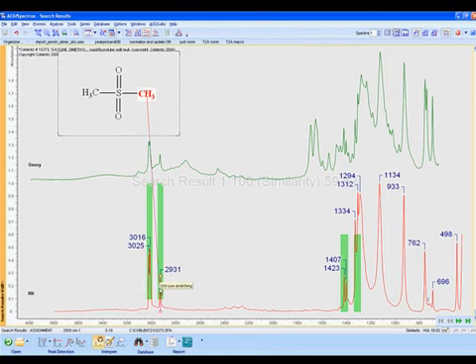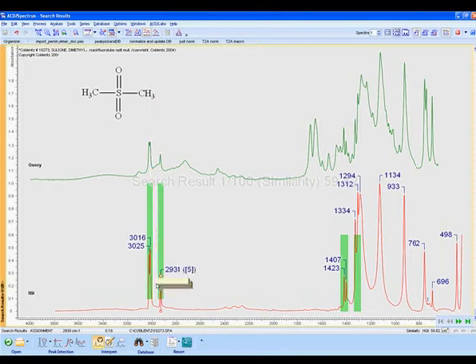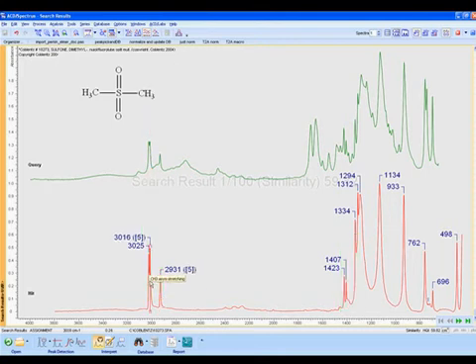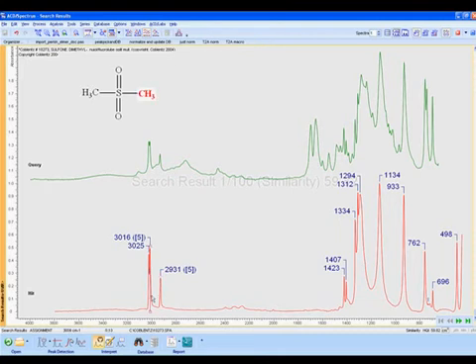To make a correlation, we can simply control-click on one or more peaks. Once correlated, mousing over either the structure or the peaks will highlight the relationship. In this way, you can make structure spectral correlations and save them to your spectrum.